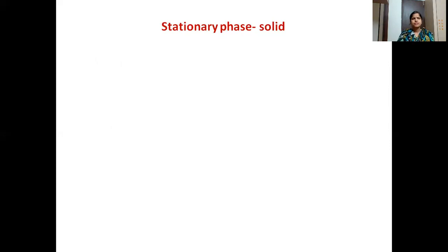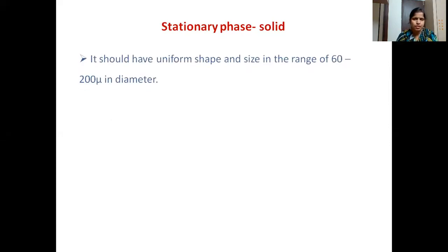Then what is the stationary phase that is used? Stationary phase, as I said, it is solid. The solid, whatever we are using as a stationary phase, should have uniform shape. The shape should be uniform and even the size. It should have both uniform shape and size.